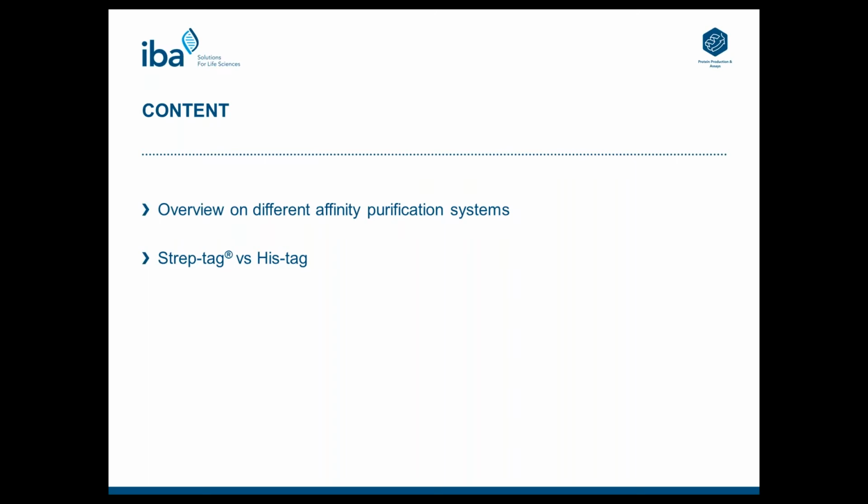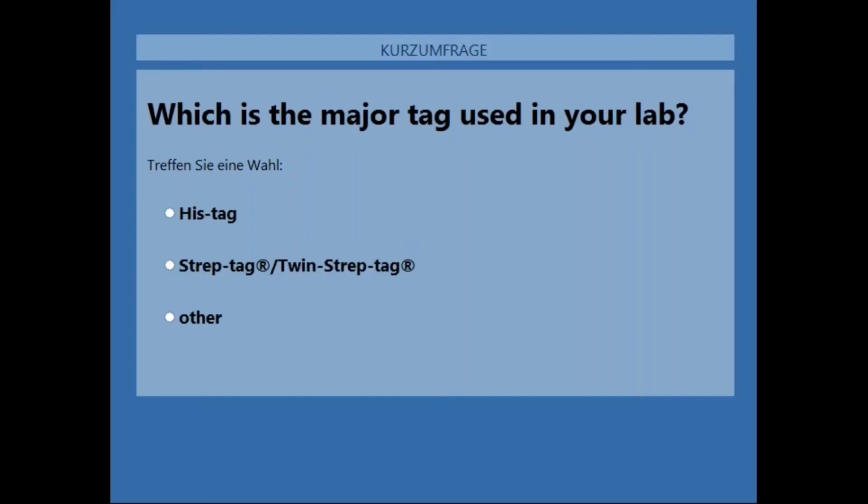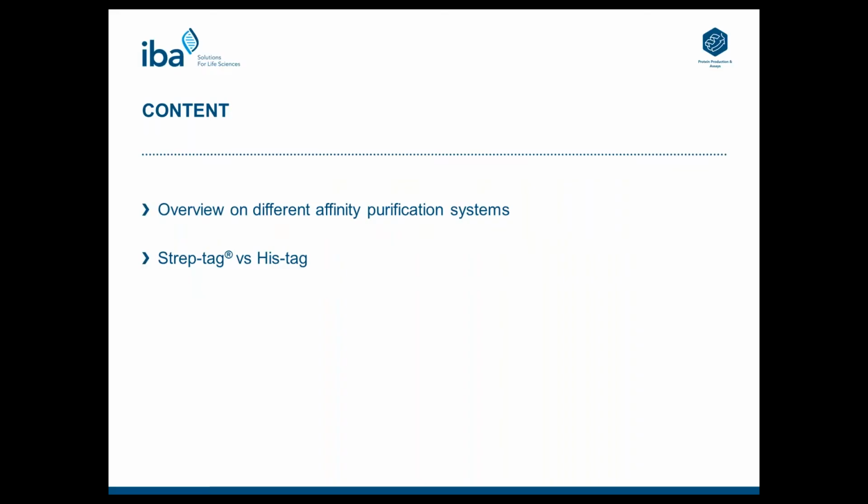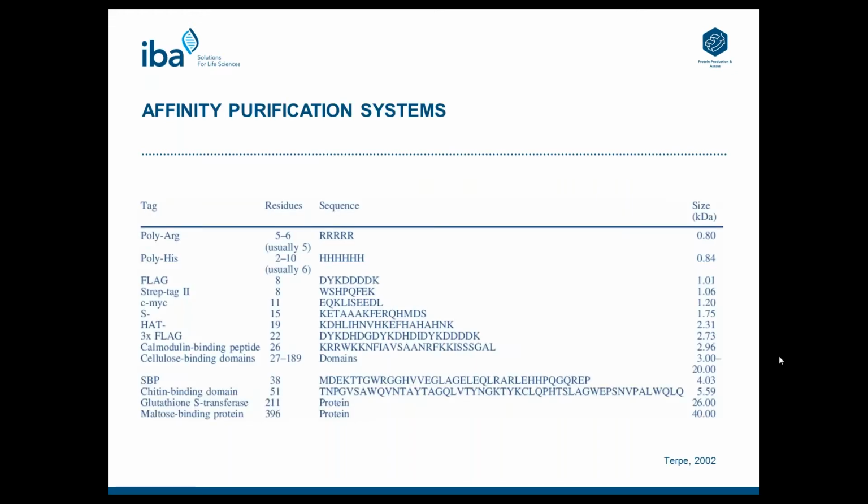At this point, I'm interested to hear which is the major tag used in your lab. Is it the Strep-tag or the His-tag? That's pretty clear. 100% use the His-tag as a major tag. So I hope after this webinar we will change this a little bit. Okay, then we begin with the webinar.